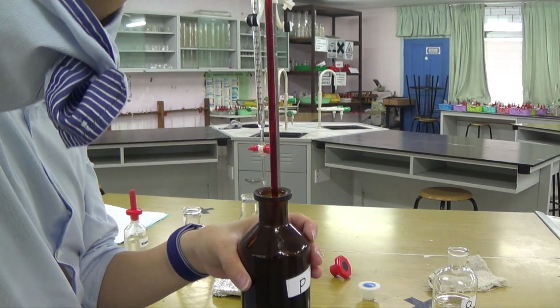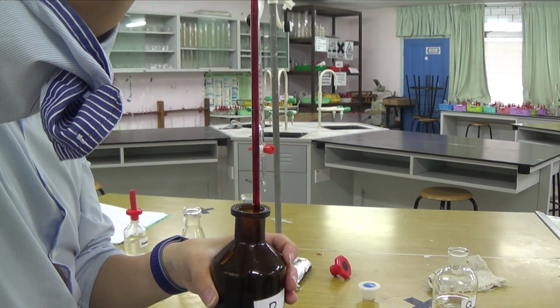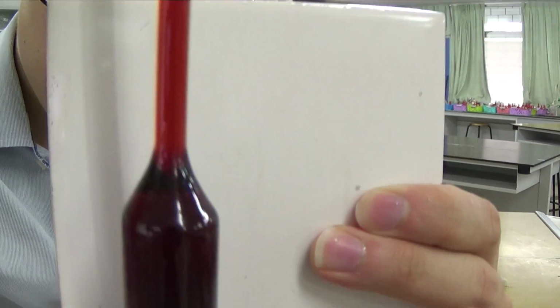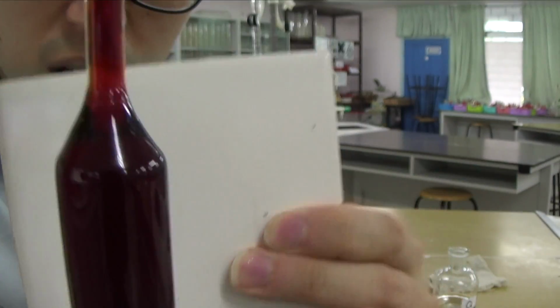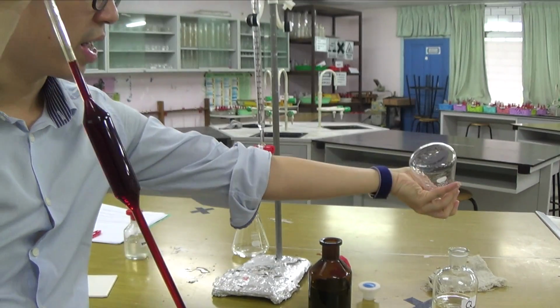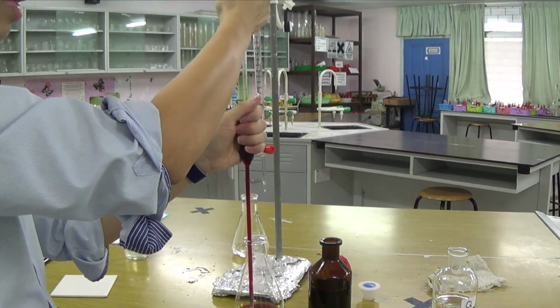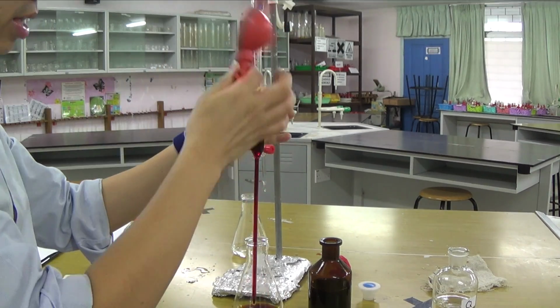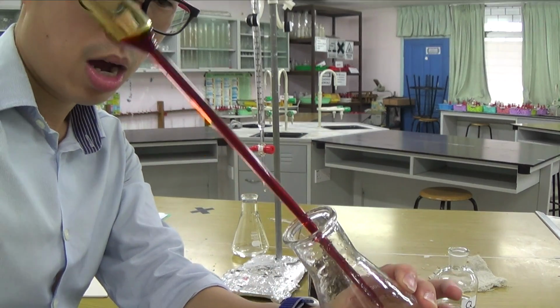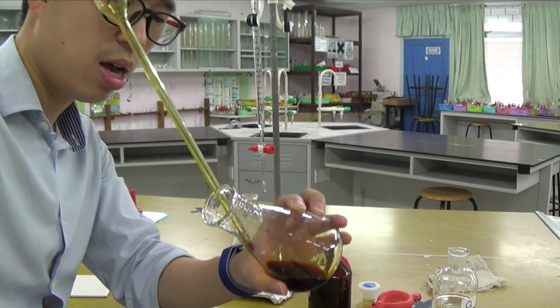But this one is a bit annoying because it keeps giving me some air bubbles. Okay, so there's 25 cm cube there, just below the meniscus. Hope that convinced you. I've got a bit of water left in there, but it's okay. Remember that a little bit of water will not affect the accurate mole of the substance that we prepared. The mole of the substance is exactly the same going into the conical flask, so it will not change the volume of the things in the burette, so it doesn't change our titer at all with a little bit of distilled water left in the conical flask.